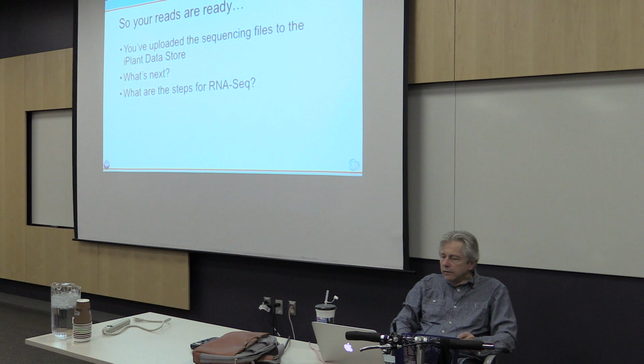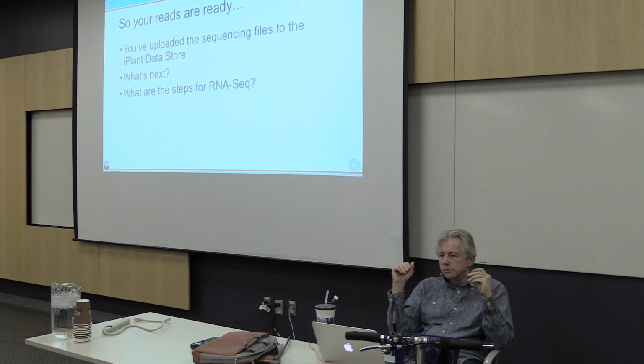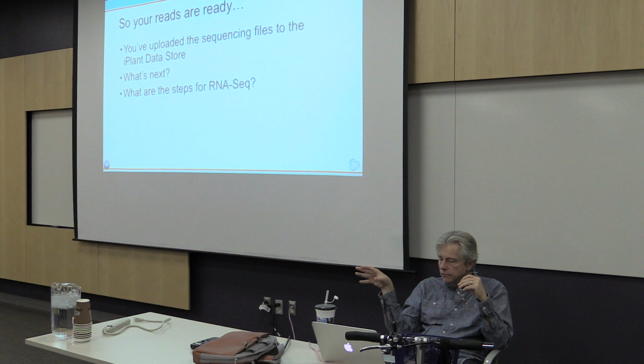So I think along the way, I haven't been here through all the workshops, that once your reads are ready and you know that the sequencing facility has produced them, and maybe you already have them on your laptop or your desktop, if you're smart and if you paid attention to what was described when somebody was talking about the data store, then maybe you already got your login for iPlant.